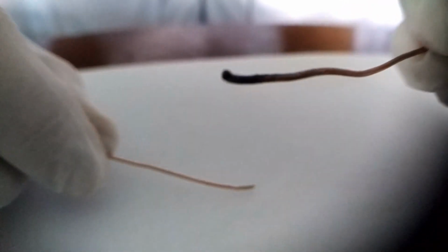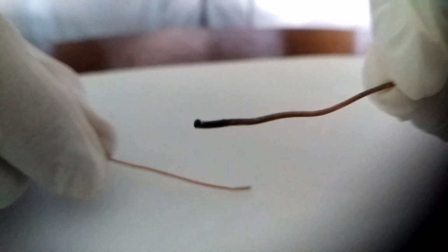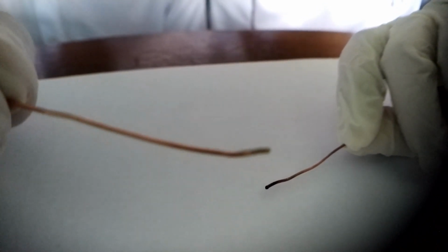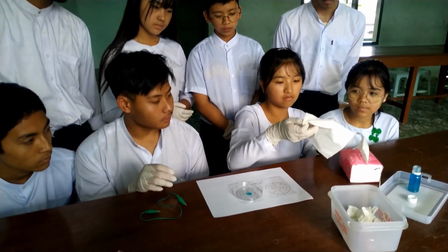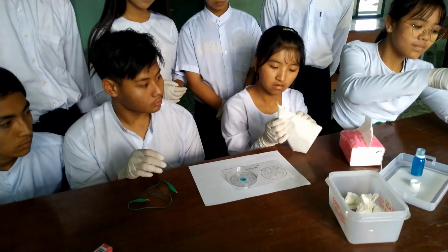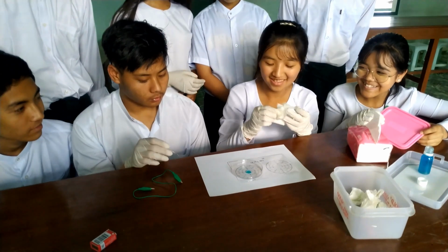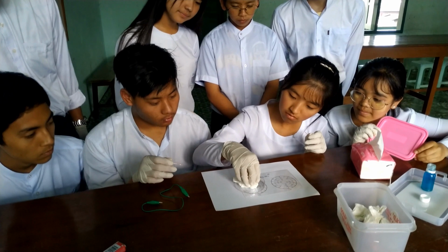After 2 minutes, take the copper wire pieces out from the solution and check the difference of the copper wire pieces before and after electrolysis. Examine what happened to the color of the solution, and it is found that the color of the solution does not change because the amount of copper deposited at the cathode is the same as the amount of Cu2+ ions dissolved in the solution from the anode. In other words, the color of the solution does not change because there is no change in concentration.